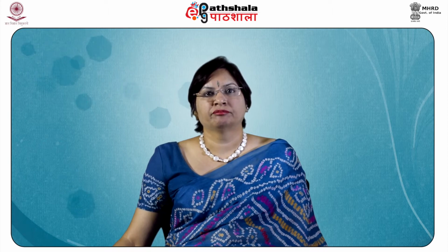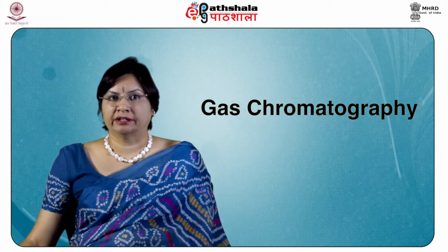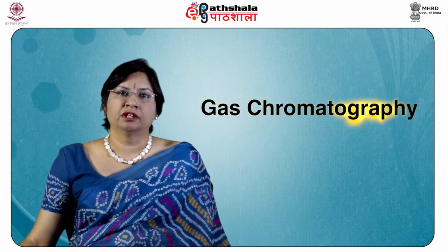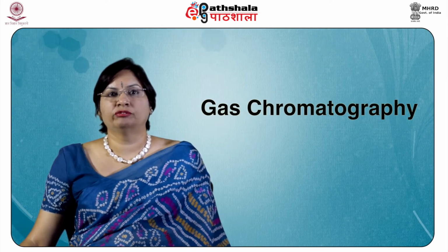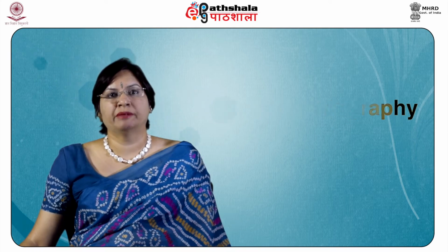So, let us try to understand how this extraction is carried out with this experiment. The concentrated extract which is so obtained is then used further for gas chromatographic analysis in both the cases, that is the one obtained from the crime scene and the other which are being used as the reference. Now, let us move further to the gas chromatography technique and how it is used in identification of the evidence that you have collected in context to their being petroleum products.